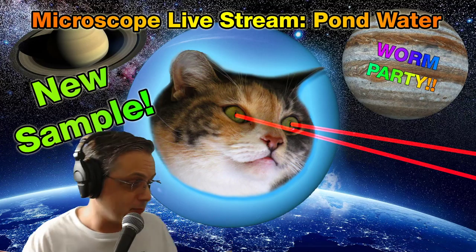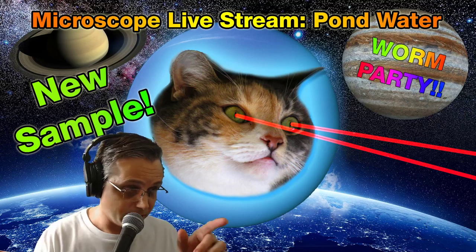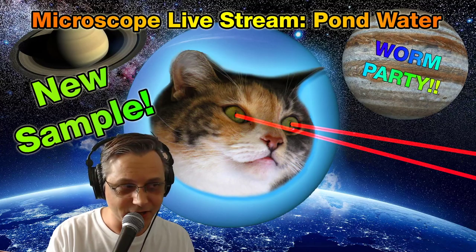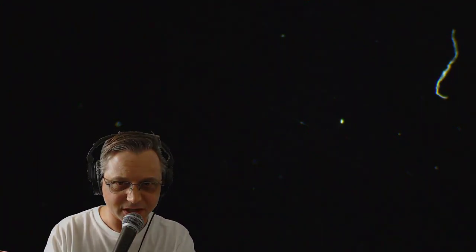I have a slide prepared, a flat slide with a cover slip of the pond water that we looked at in the last stream, so we can see if it has increased our visibility. There are a couple of bubbles in here too. I think that's the edge of the cover slip. Oh, there are some things in here. This guy's making himself dizzy. Looks like we have a little rotifer friend right here.